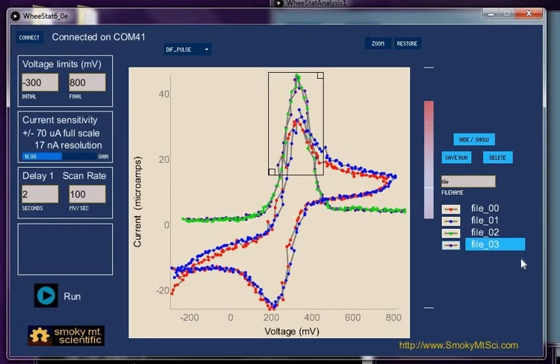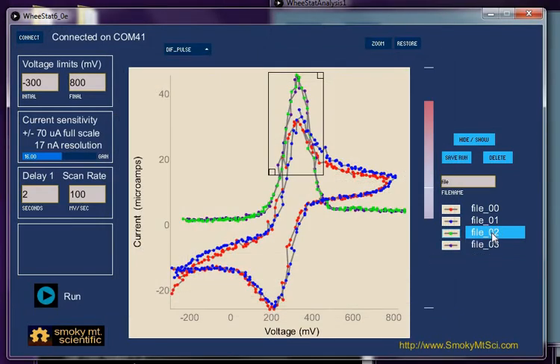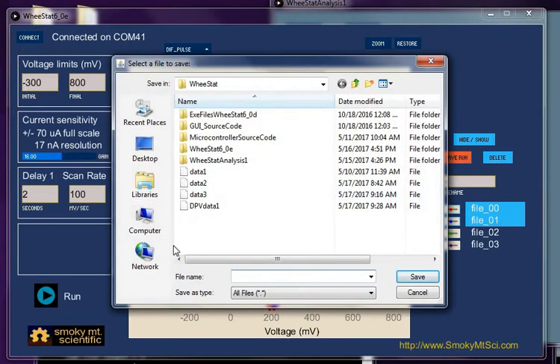What we want to do now is to select our two differential pulse voltammetry experiments and save those. We're going to call it data one. We're going to save that in a place where we know where it is. We're then going to deselect those two and select our two cyclic voltammograms and save them. Let's call those cyclic voltammetry data one.